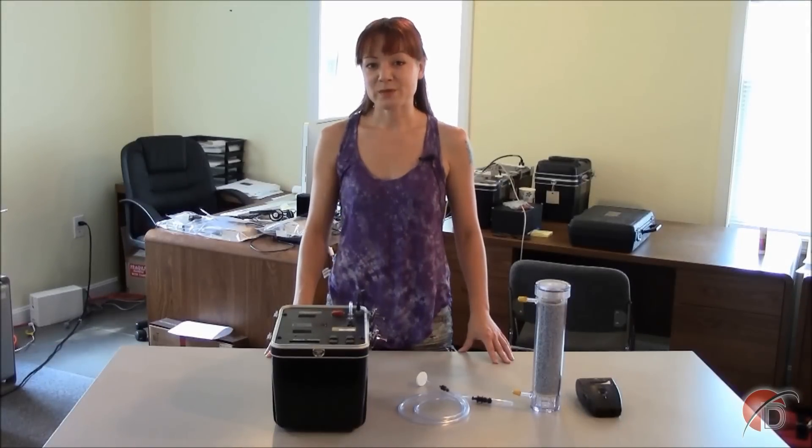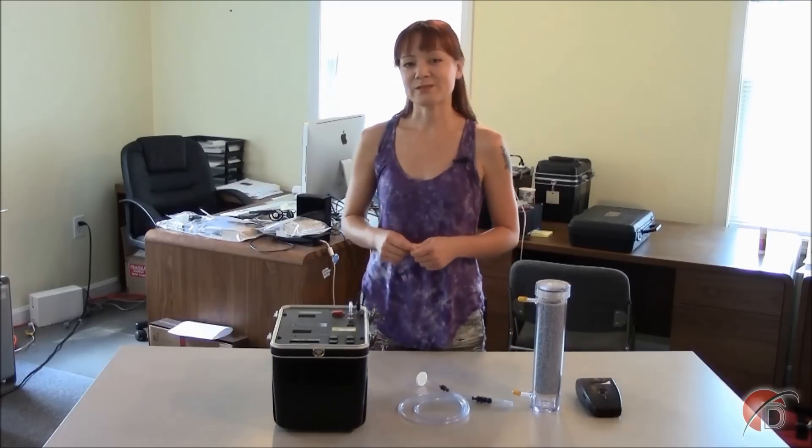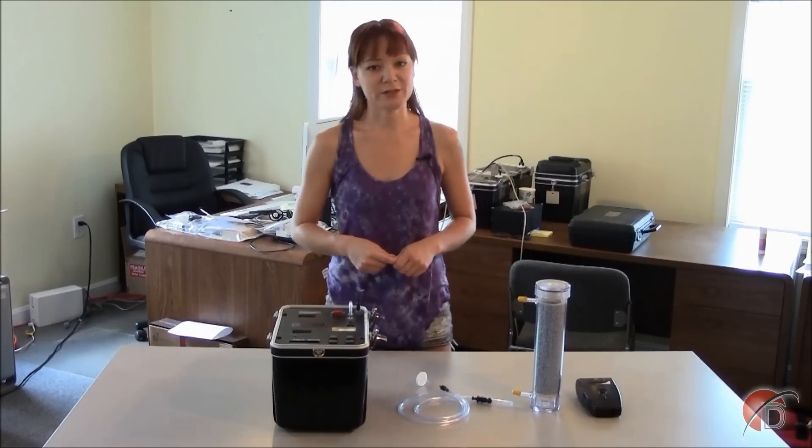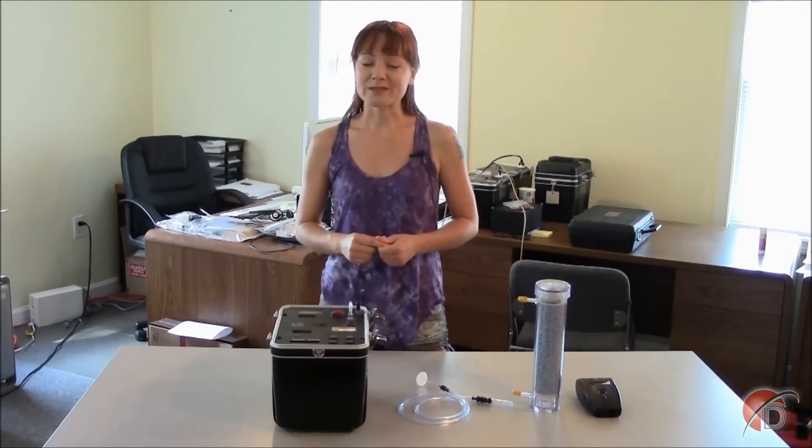This tutorial will guide you step-by-step in using your RAD7 to conduct a one-day measurement. Under these settings, the RAD7 will continuously monitor radon at the deployment location to give an accurate and precise measurement of radon in the area as well as its variability. The RAD7 has eight protocols pre-programmed into it, and these are described in the user manual. But for now, let's conduct a quick and easy one-day test.